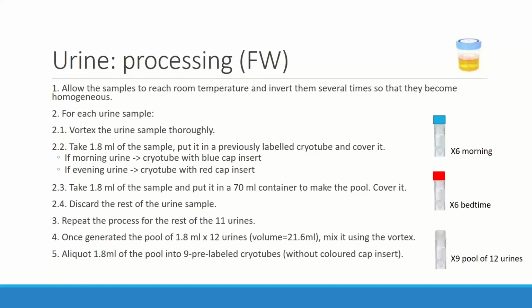But Maribel, I guess that it's good if the cohorts can keep more than one aliquot. Yeah, of course. If you have space in the freezers, it's always nice to keep more urine, because I think it's one of the best biological samples. We have also realized now that we are participating in some of these Green Deal new projects, and for some targeted approaches they are asking us for like 5 milliliters of urine, and this is impossible.